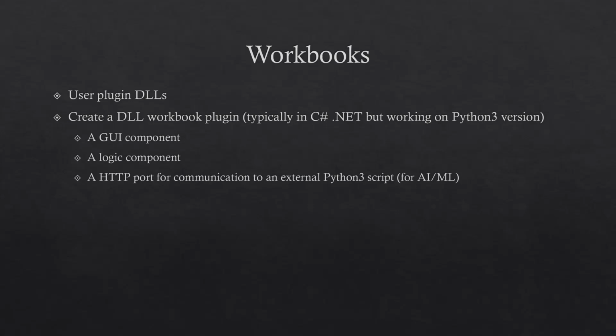The AI logic itself can still run wherever makes the most sense: directly inside the plugin, in a local Python process, on an edge system, or through a remote cloud service. The workbook simply provides the integration and presentation layer. This means users are not limited to just adding headless AI models in UnicornOne. They can create entirely new scientific tools and applications that behave as though they were built into UnicornOne from the beginning.